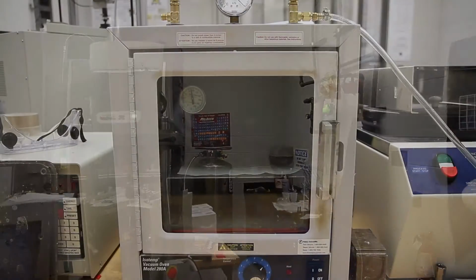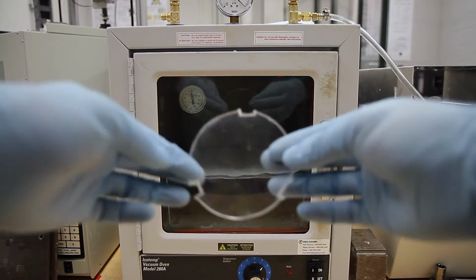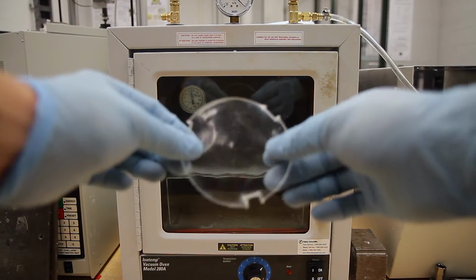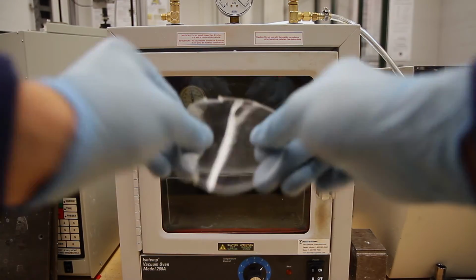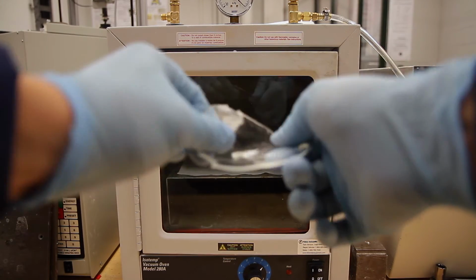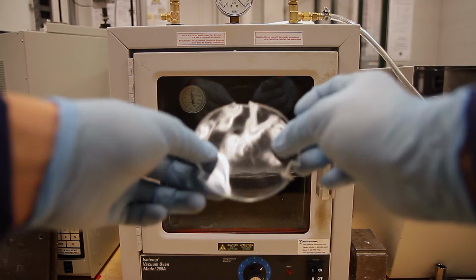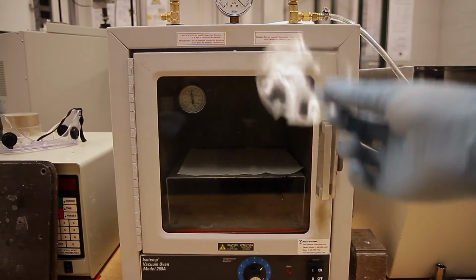Let's watch a video that demonstrates this effect more apparently. Okay, this is an SMP sample at room temperature. It is just like a regular plastic. It is quite stiff, hence I can't really bend or twist at this stage. Simply, I cannot deform this unless I apply a large force.